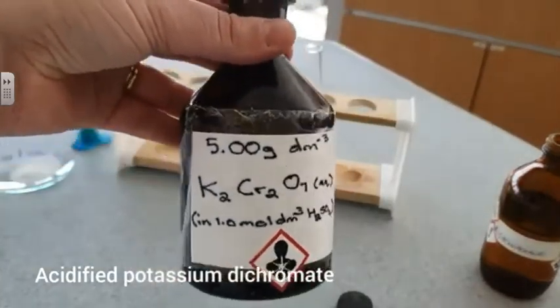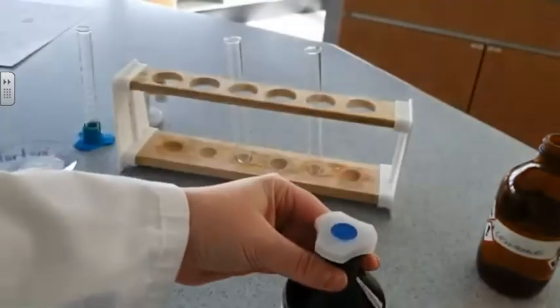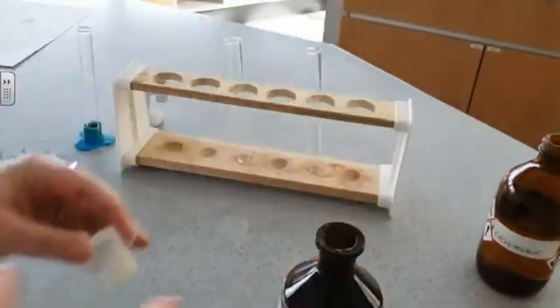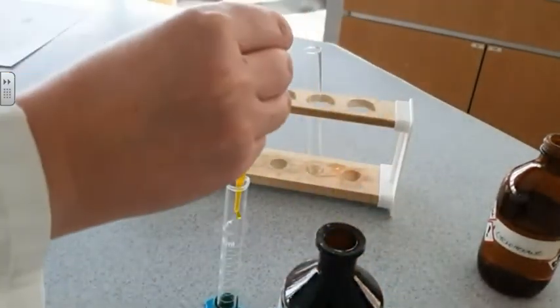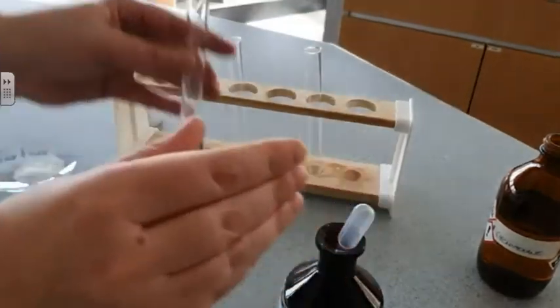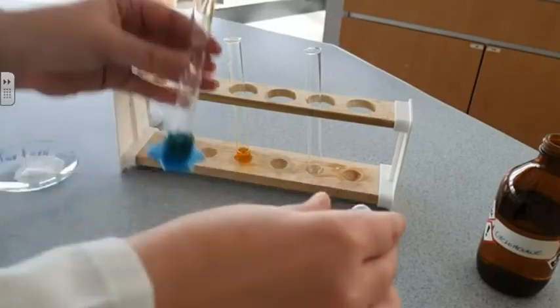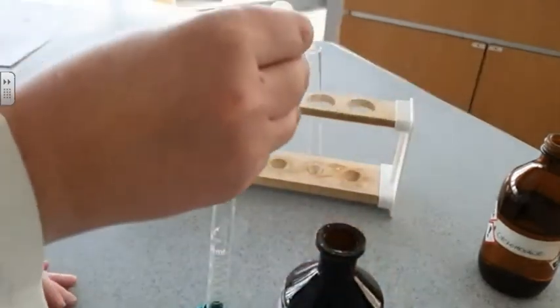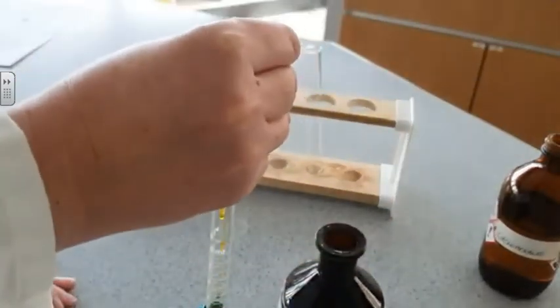And then finally we've got the test for primary and secondary alcohols. And we're going to use acidified potassium dichromate, because primary and secondary alcohols can be oxidized when warmed with acidified potassium dichromate. So just adding a small amount of acidified potassium dichromate to each of these two test tubes.